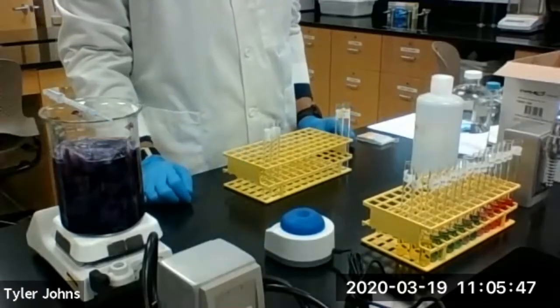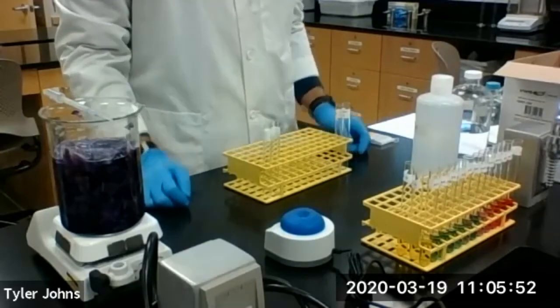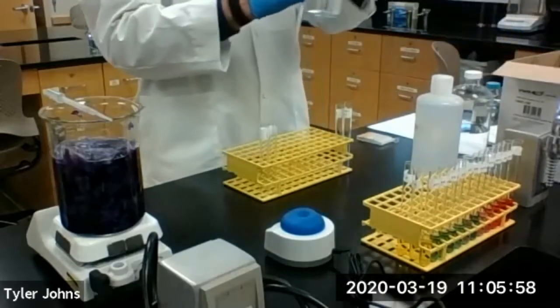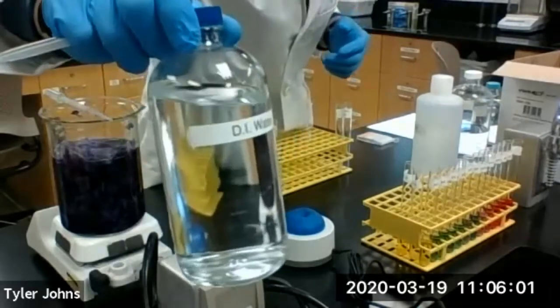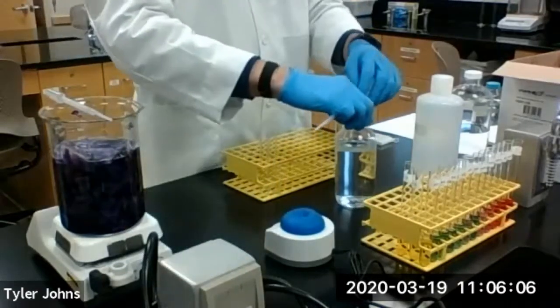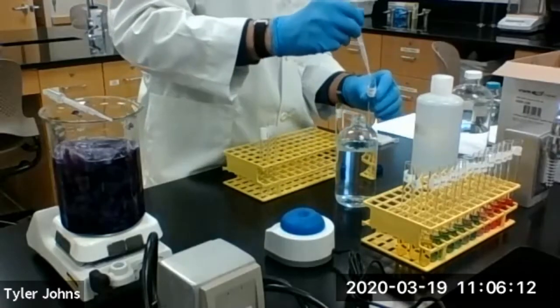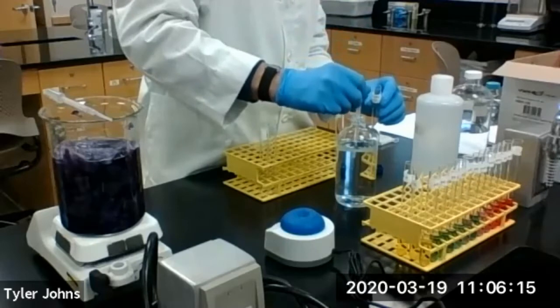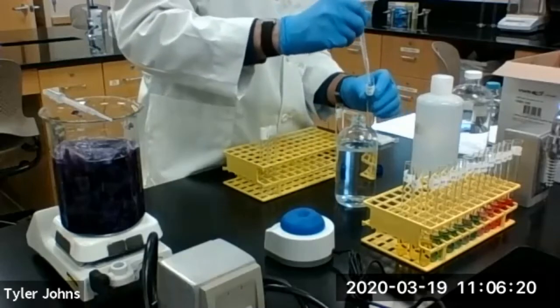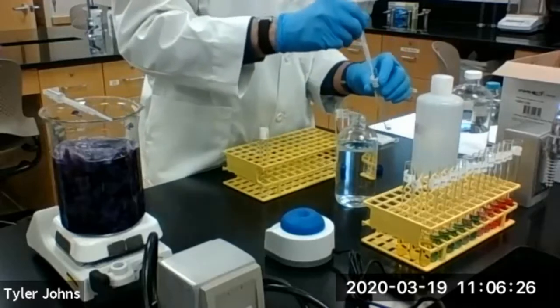Okay, for the final part of this experiment, we're going to be looking at the effects of buffers on pH. In order to do this, we're first going to aliquot out 5 milliliters of deionized water into 2 test tubes. And the second test tube.